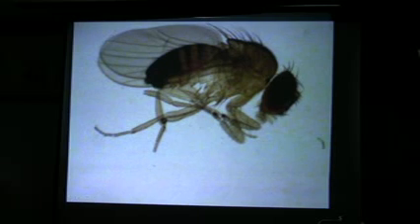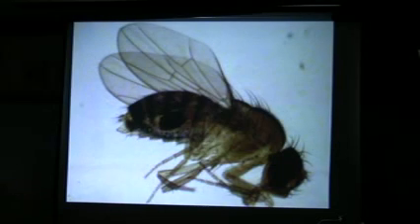And there will be a slide that I'll show you during the exam. It's going to be clear like that. This is clear. I'm not going to make it ambiguous or anything like that. But hopefully I'll find a slide that does not have eggs in there.